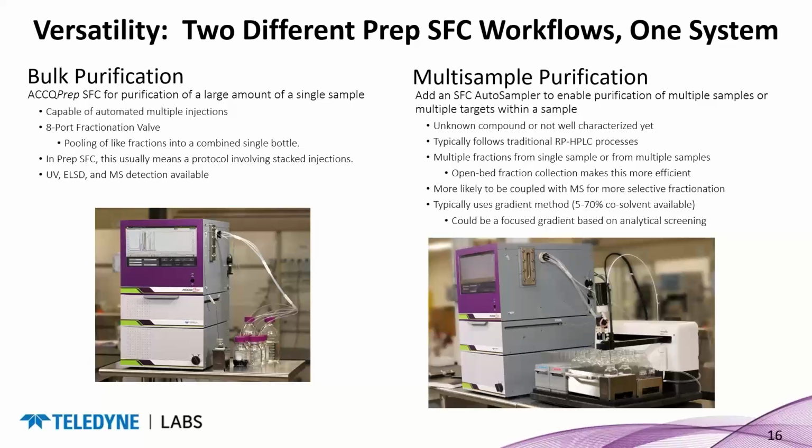And you'd only utilize maybe 1 milligram or 2 of sample, depending on how you do it, and assuming you can detect it. There are electronic ways to increase the signal to noise for doing that. Then you can take that scout information and go right to what we call a focus gradient algorithm and generate your method quickly.